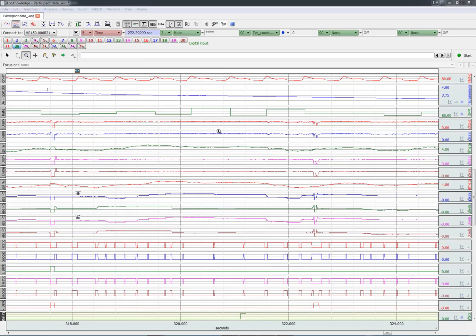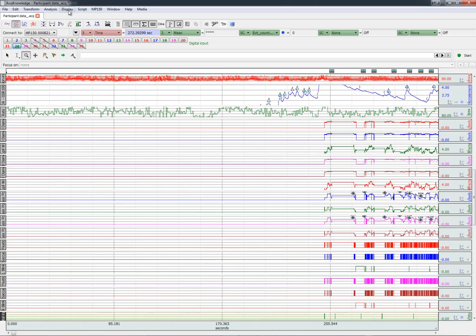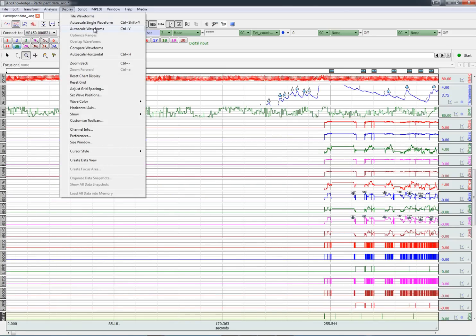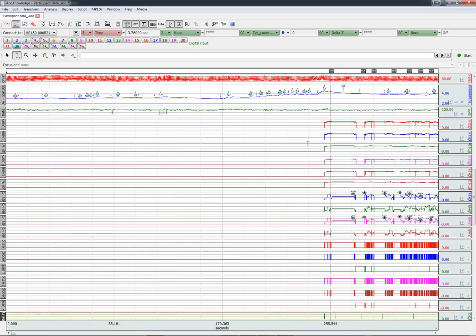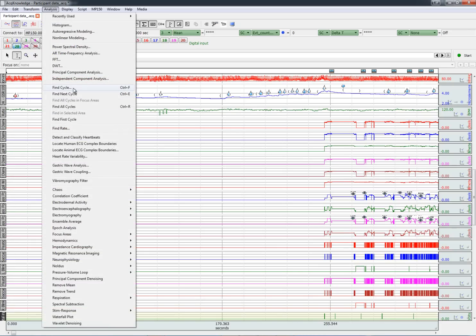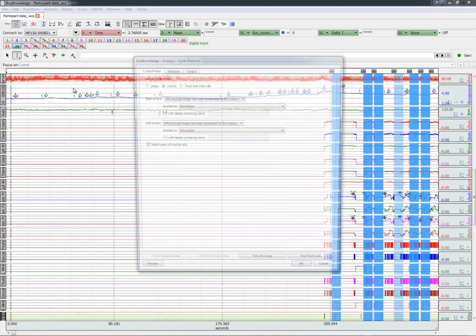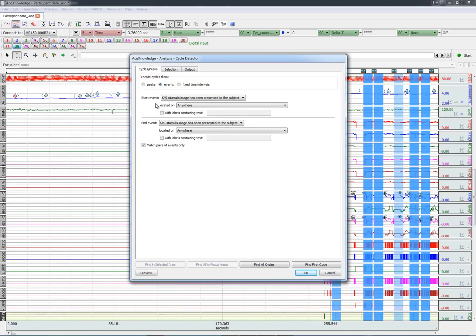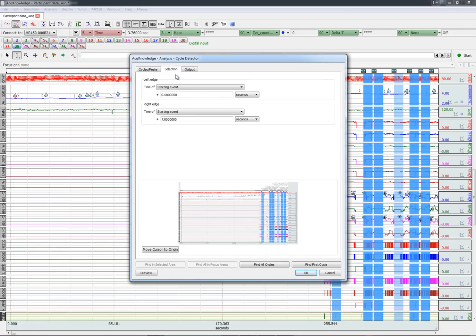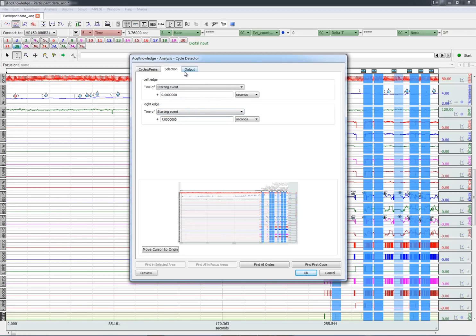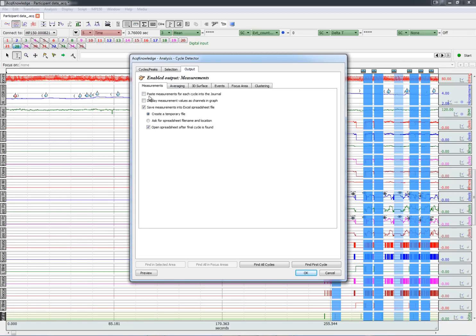Now that we have the physiological data and the eye tracking data in the same synchronized data file, we can explore the relationship between them. For example, we could calculate the mean heart rate for 7 seconds following each stimulus presentation. We have to go to find cycle, choose the start and end event. In this case, it would be the SMI stimulus presentations. And then we'll highlight from 0 to 7 seconds after the beginning of the stimulus presentation and output the results in Excel.